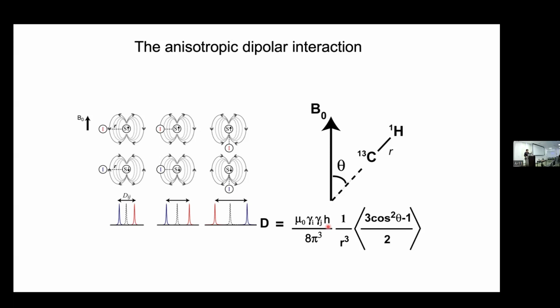I mean, you can always try to deal with the complexity of the spin system, but 90 hertz is your typical J coupling. Say on the order of 20 hertz maximum, or 24 hertz. So that means that in NMR you'll measure 90 plus 24 hertz. So to get 24 hertz instead of 24 kilohertz, what sort of alignment levels do you need?